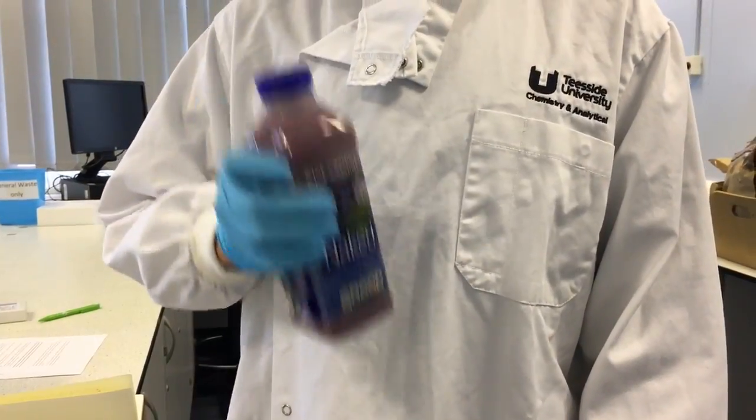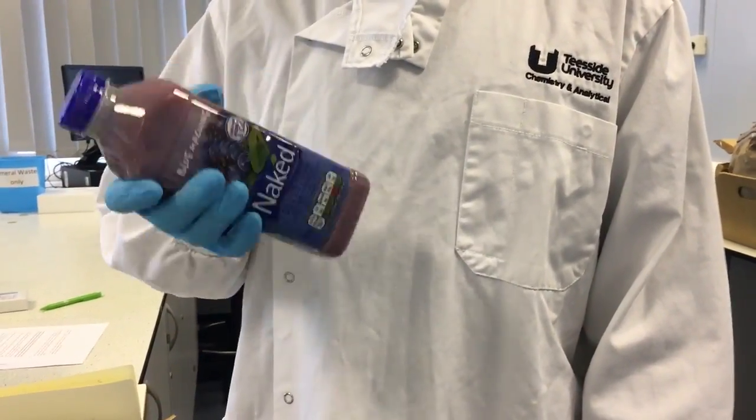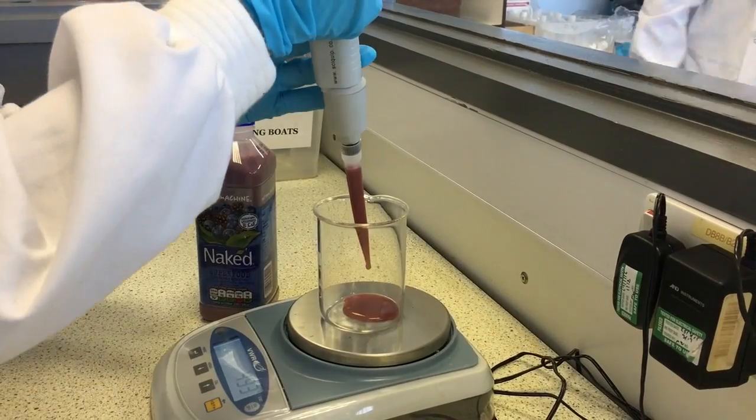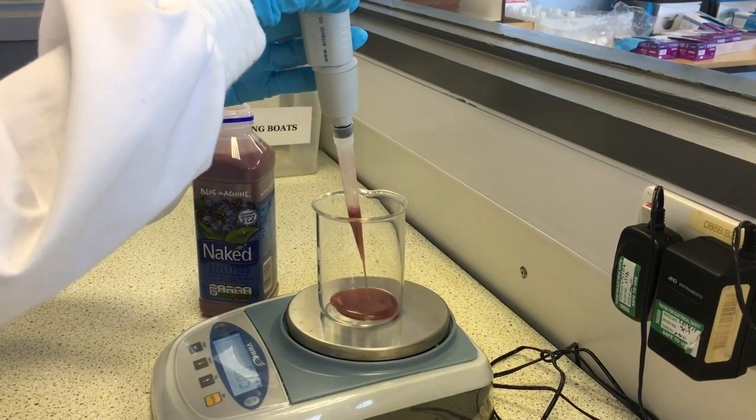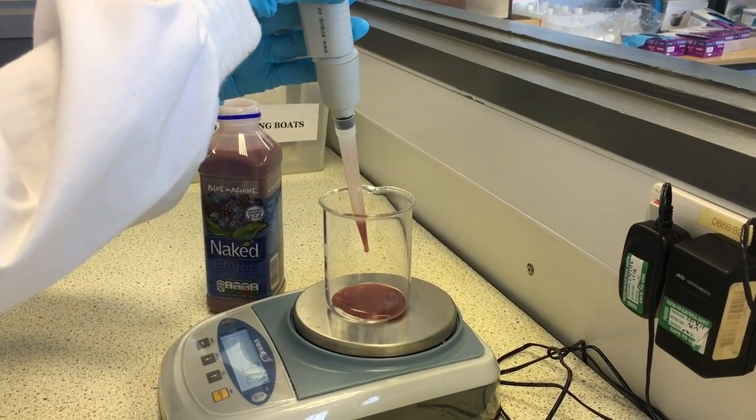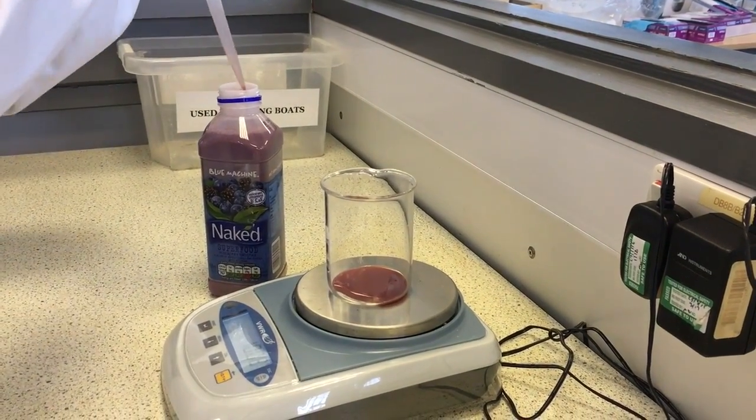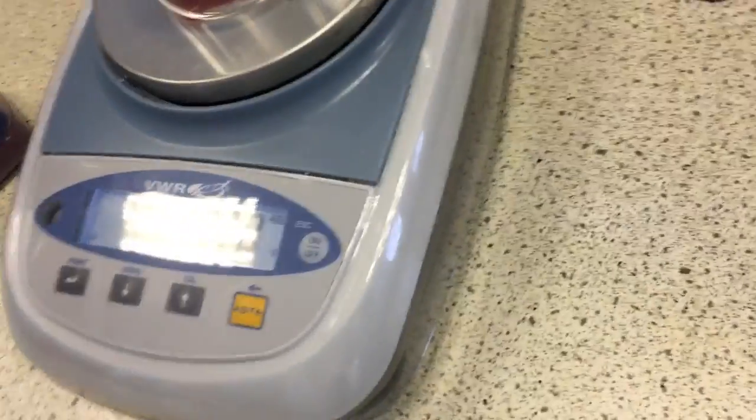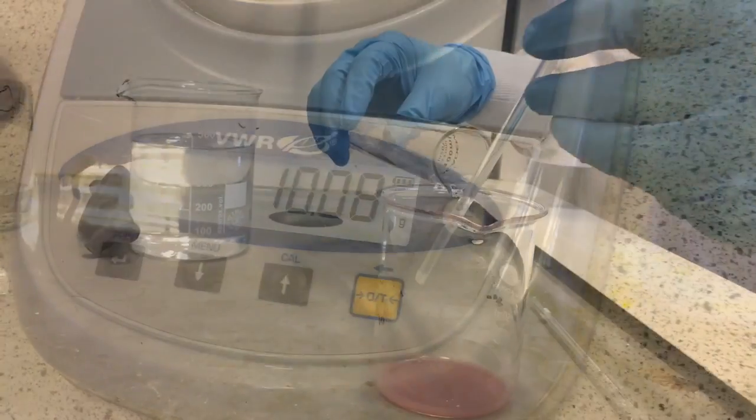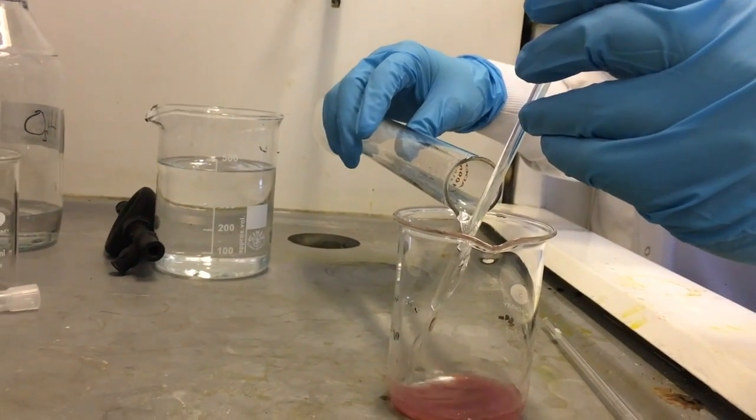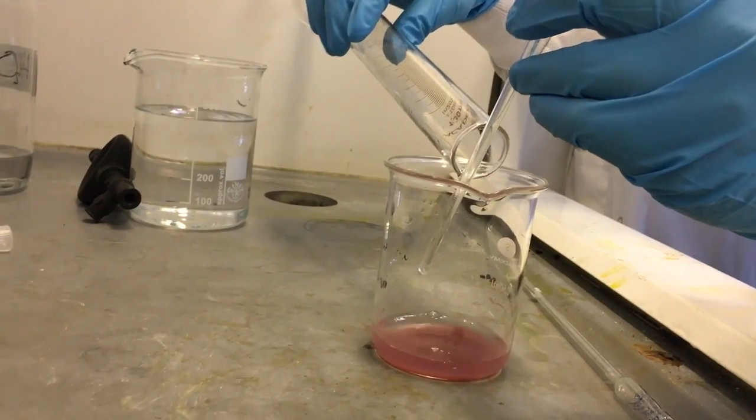We shook the smoothies to ensure there's an even distribution of particles. Next, we weighed approximately 10 grams of our sample. Getting a weighted measure gives us a more accurate measurement than using only a pipette to measure volume. Then we added 20 milliliters of the extraction solvent into the smoothie sample.